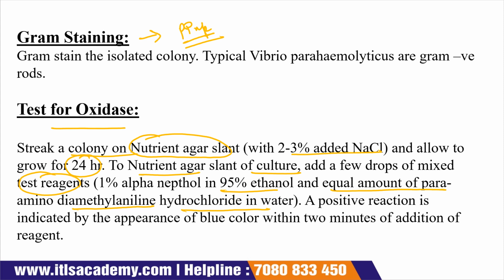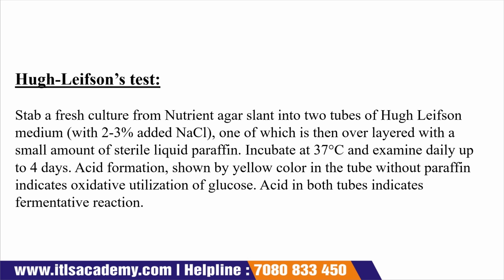If the reaction is positive, then it will be indicated by the appearance of a blue color within 2 minutes of addition of the reagent. Okay, so within 2 minutes of the addition of this reagent, we get a blue color appearance, and it will indicate the presence of the microorganism. The next is Hugh Leifson's test.